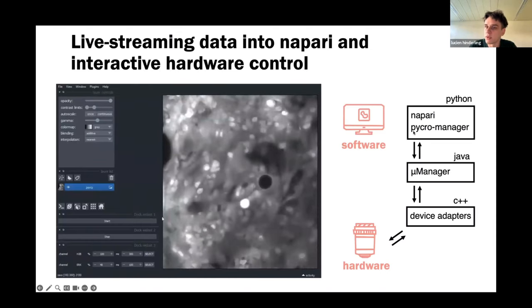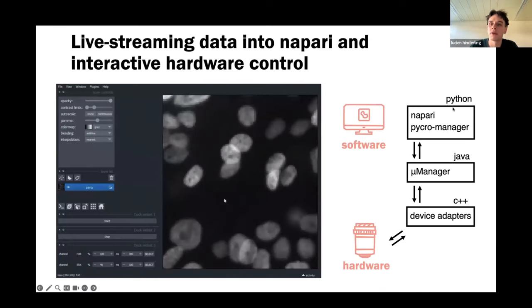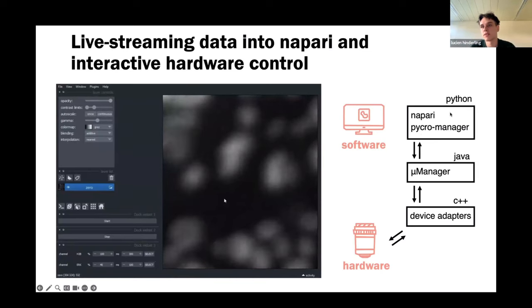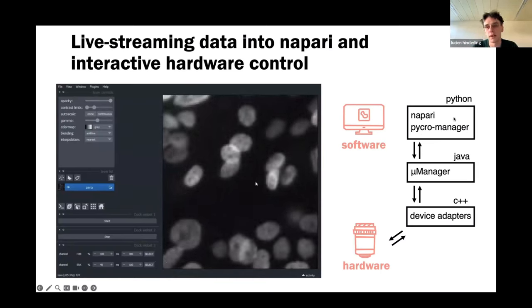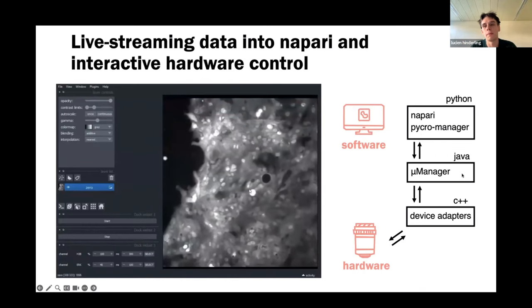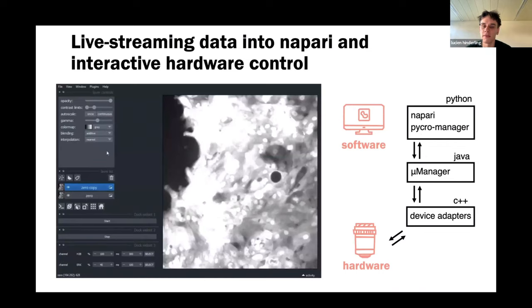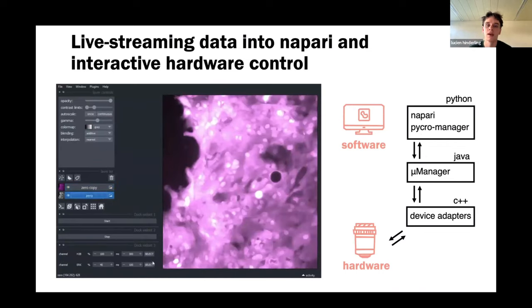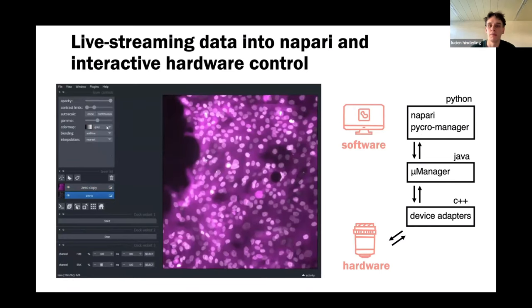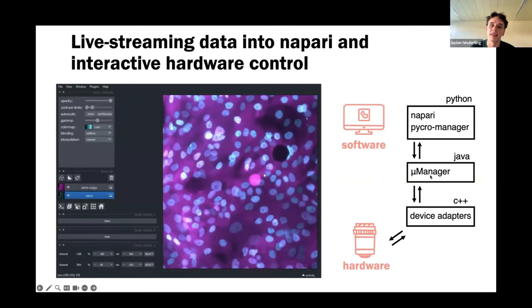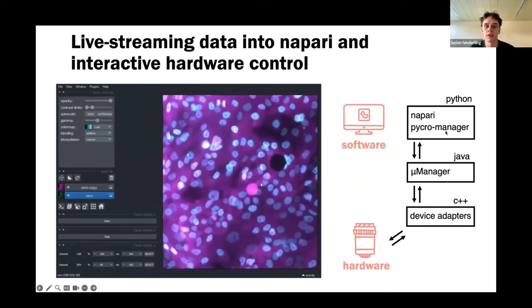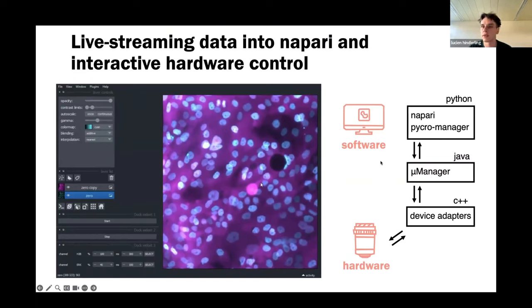Our software stack uses Napari and Pycromanager in Python, because we want to use the Python ecosystem for image analysis — all the deep learning tools and our favorite plugins are there. MicroManager is Java-based and serves as an interface to the hardware. It's an amazing piece of software supporting over 250 cameras, lights, stages, and more. By using Pycromanager — which is a direct Python layer on top of MicroManager — you can interact with the hardware from the Python ecosystem. The nice thing is you can access your hardware directly from Python.